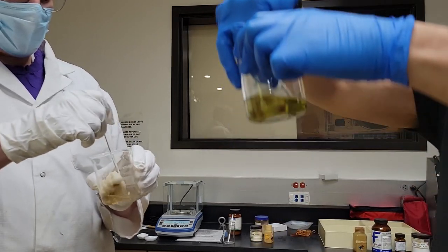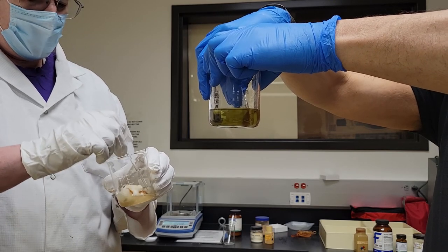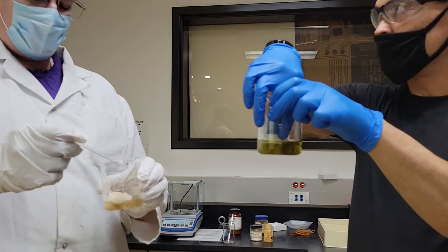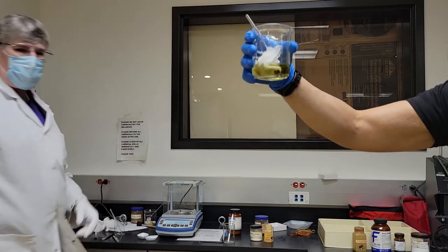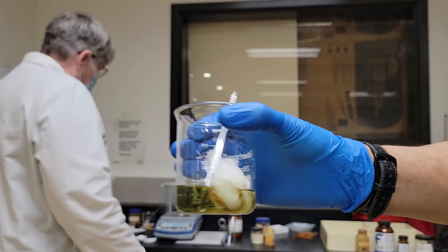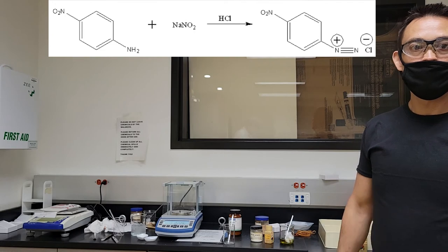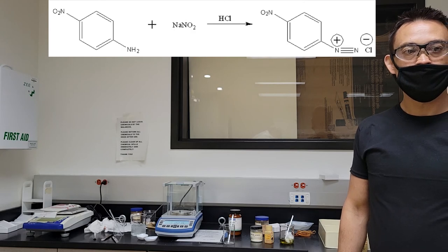If you do not put a phenoxide into the cheesecloth, it won't activate it, and it won't be able to create the bond. Because the instant our diazonium compound comes in contact with these, it'll instantaneously change colors — we'll show you that in a second. So I'm just going to let this one soak while I prepare the other part. We're going to make a diazonium and do a diazonium coupling. We'll both need an ice bath, because if this goes over five degrees, it will decompose spontaneously and won't work as well.